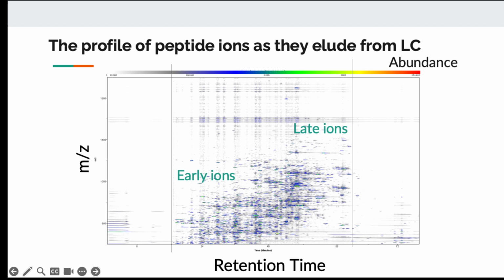And at the end here, these are the protein and peptide that move slowly through the chromatography. So this might be large protein, large peptide, might be hydrophobic, depending on how you design your chromatography. Peptides with certain chemical properties will flow through very fast, and peptides and proteins with other properties will flow through very slowly. So we can isolate different protein and peptide through chromatography.